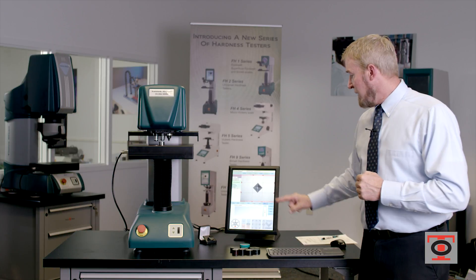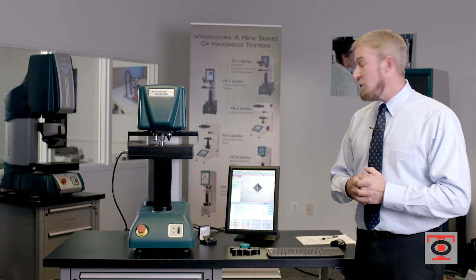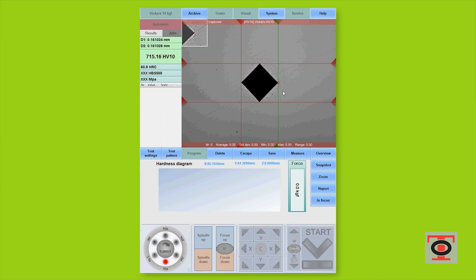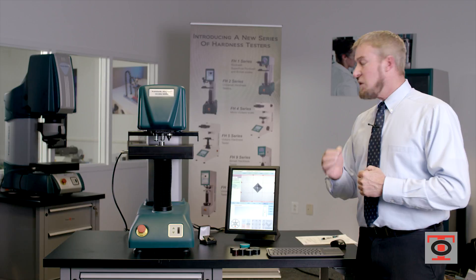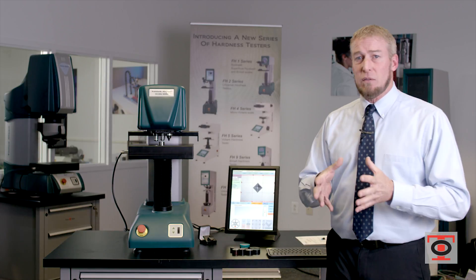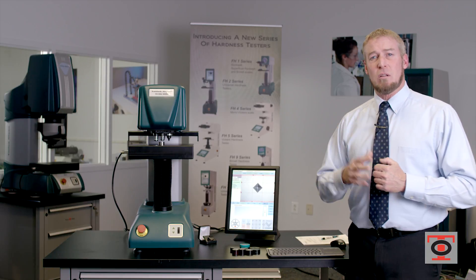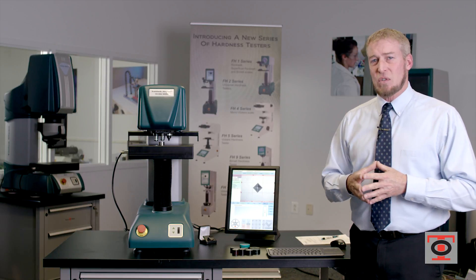What I also want to show you is that it did find the points of the Vickers indentation immediately. Even though it found the points, some of you out there are actually research labs. When I look at that, it looks like a good read by the machine. The most difficult thing as a research lab is finding that nth degree in microns of the measurement. So this particular machine — this functionality comes standard with it.